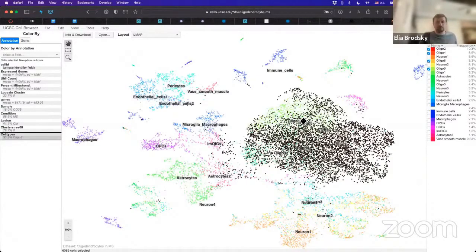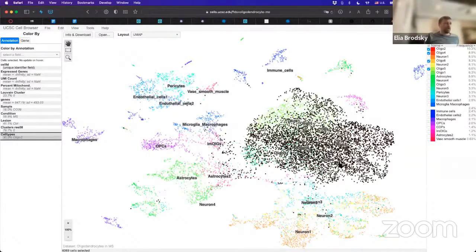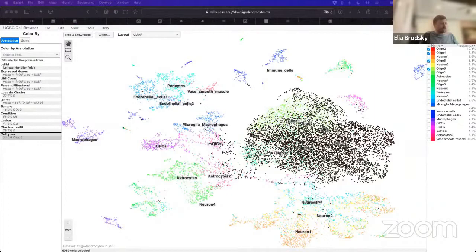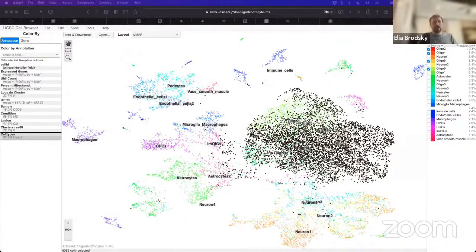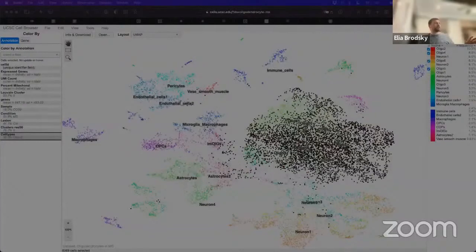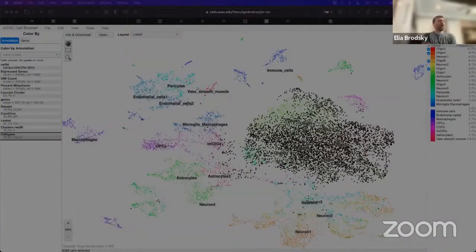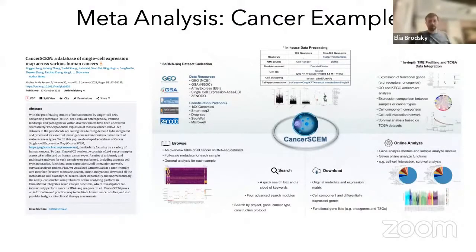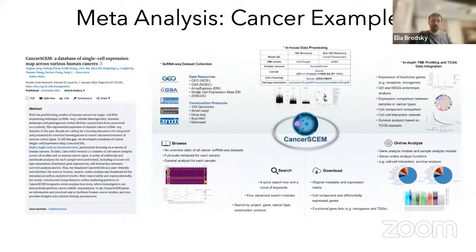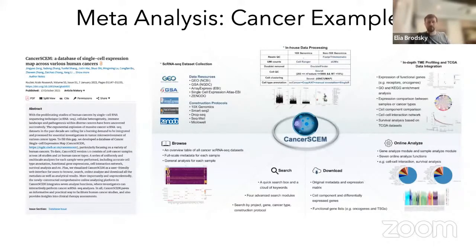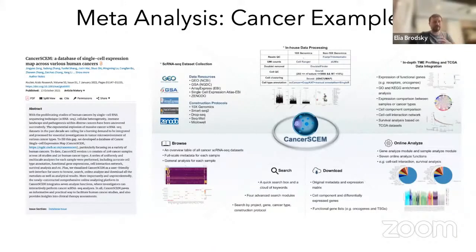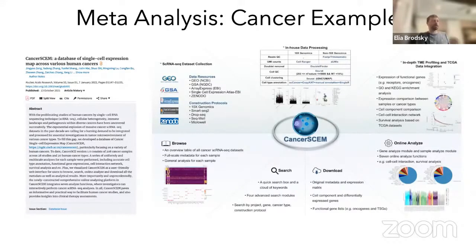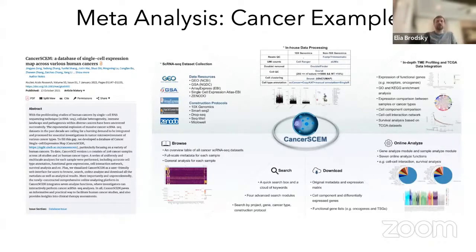The next thing that we want to look at is some examples from disease. So here we saw these are healthy tissues. Now let's look at disease. This is a collection of data that was taken from all of the possible data sets that are available on tumors.